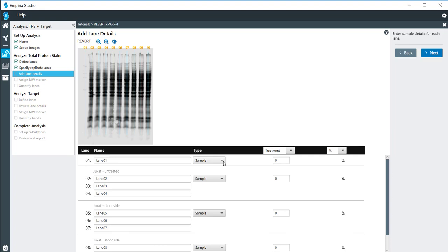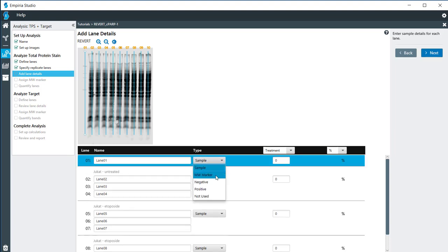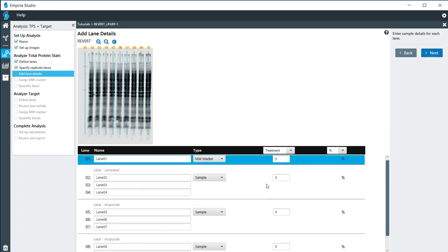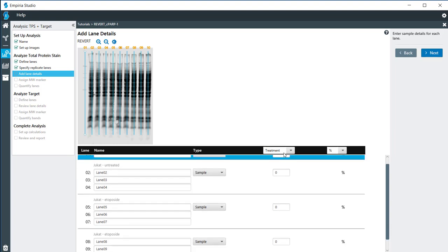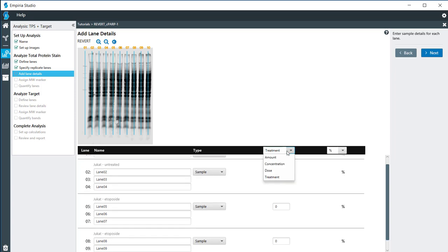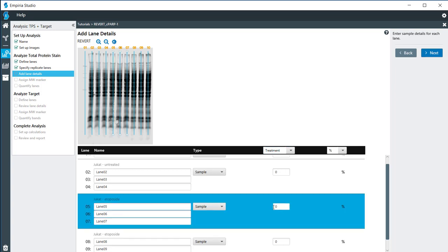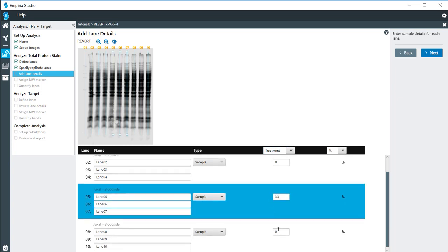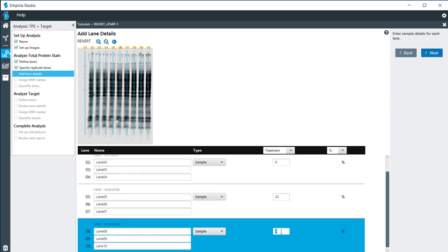My first lane here is the molecular weight marker. Then I'm going to set up my treatment conditions. You can also add in the amount of drug that was added, the concentration, dosage, but I'm going to use treatment for this one. My first lanes were the untreated, so I'm going to leave that at 0%. My second replicate was 33%, and then the next replicate was 100%.